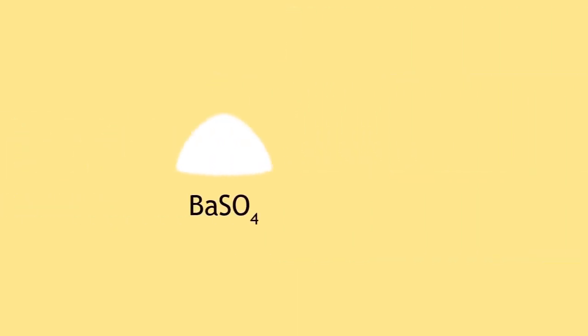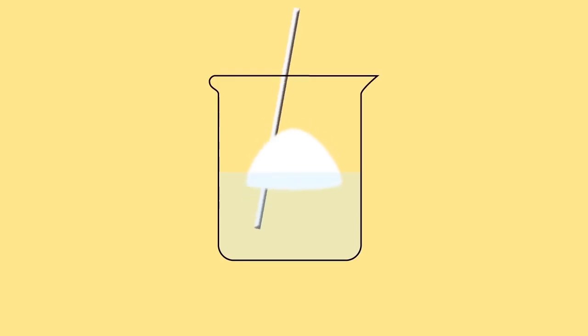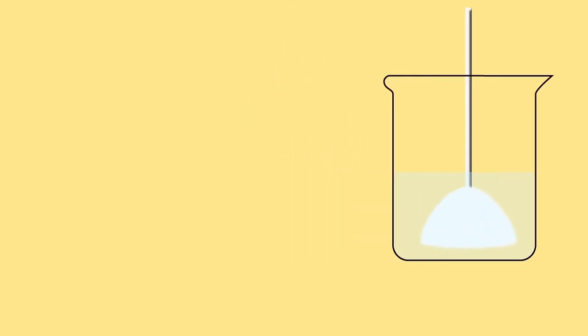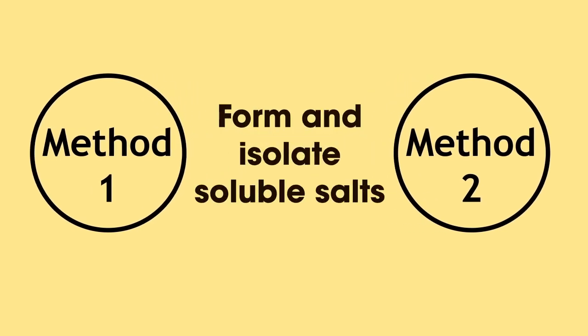Some others, such as barium sulfate, used as a contrast agent when forming an X-ray image of the gastrointestinal tract, are insoluble in water. In this lesson, we will learn two different methods to form and isolate soluble salts.